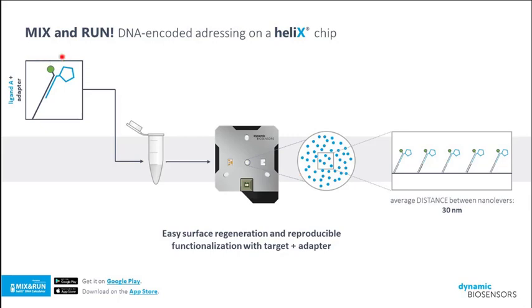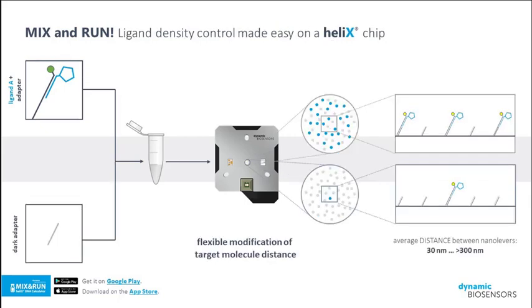What we do is create a premix, or a ligand mix, which carries the fluorophore. This is the reporter fluorophore that we use in order to monitor the binding kinetics, and that is pre-hybridized with DNA that is attached either covalently or using capture methods to the antigen of choice. In this case, we're going to refer to it as ligand A. This solution is pre-hybridized and flowed over the surface. DNA hybridization is highly efficient. As a result, we immobilize this ligand onto the surface. So from a non-functionalized chip, we can create a functional one using minimal sample and a very quick assay workflow.